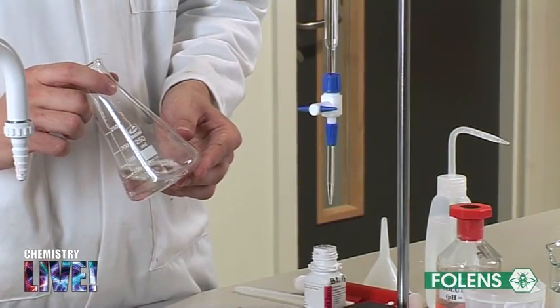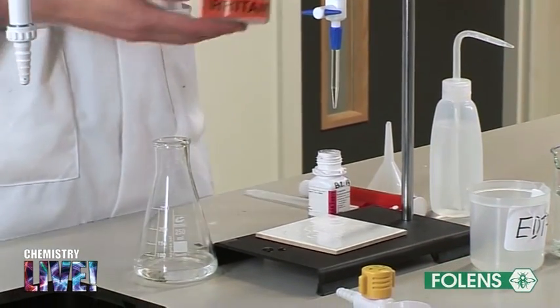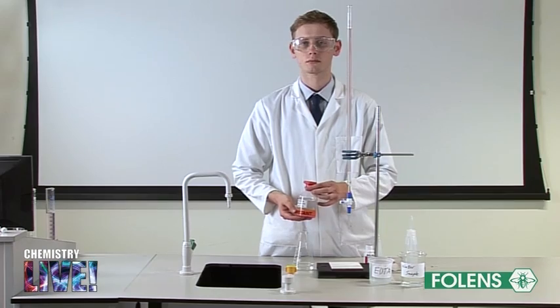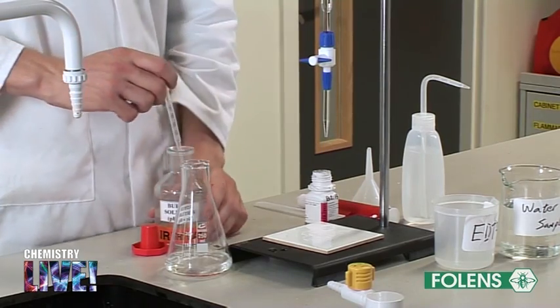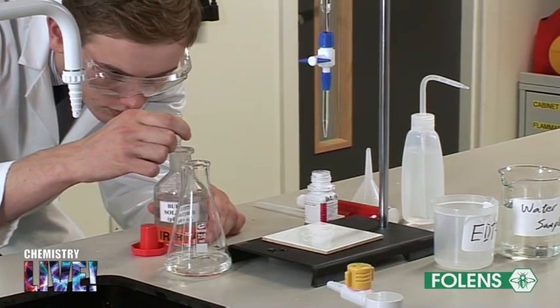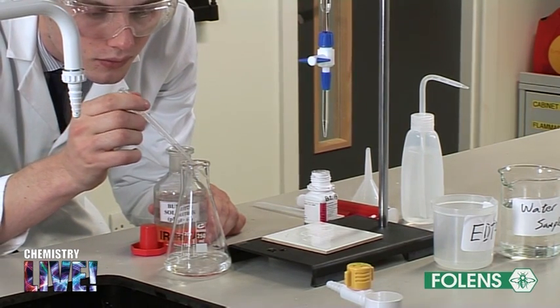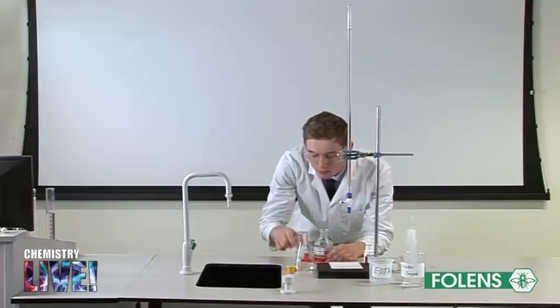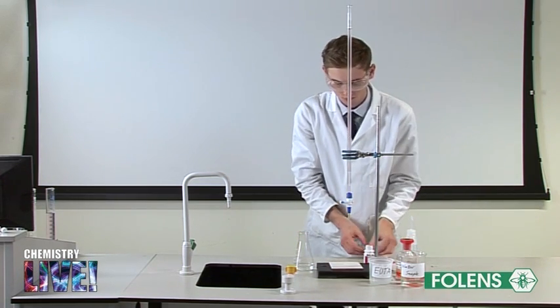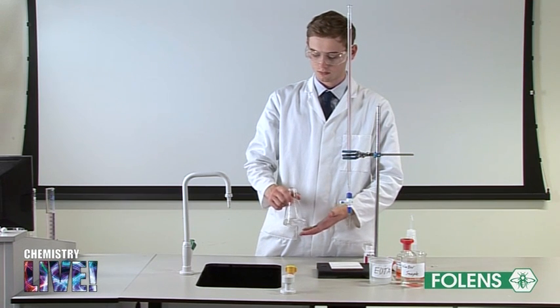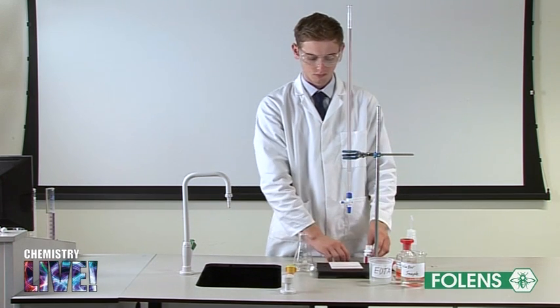Add 1 cm³ of the buffer solution to the conical flask. Add a small amount of the solid eriochrome black T indicator to the conical flask also.